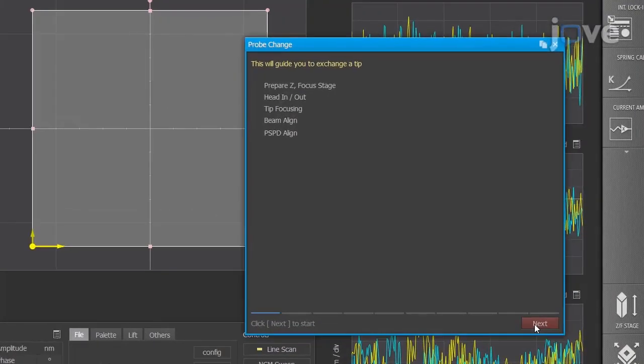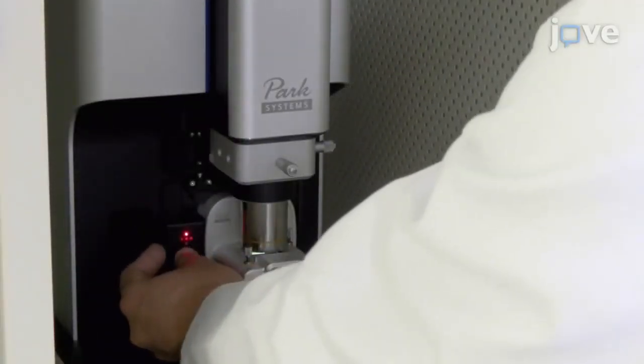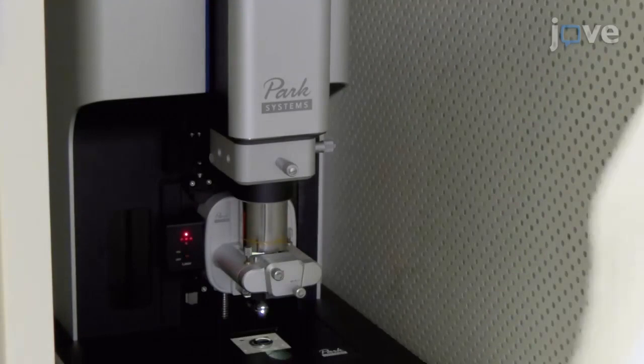In the Probe change window, click Next to prepare Z focus stage, then turn off the AFM beam switch if it is on and unlock the dovetail locks.